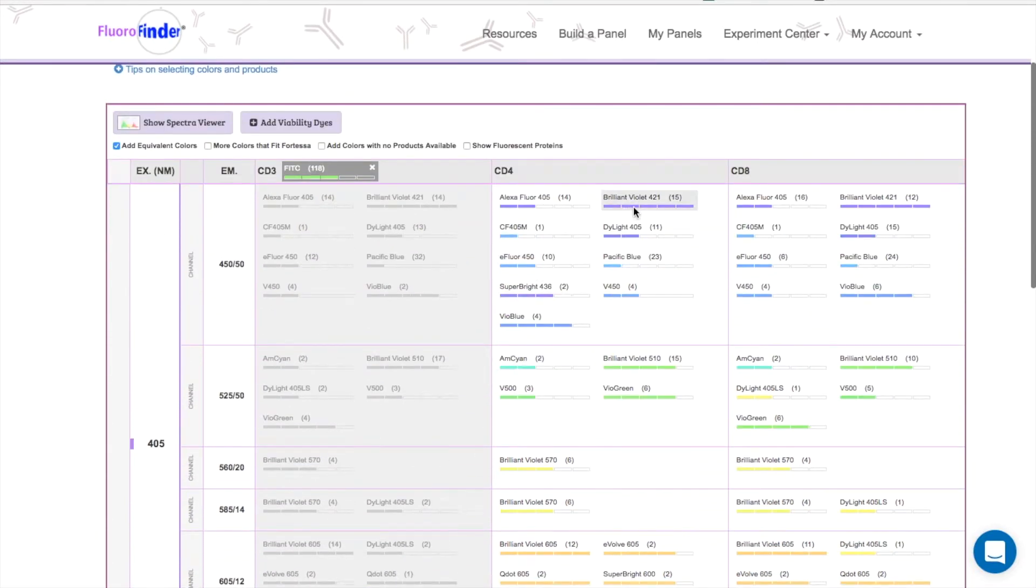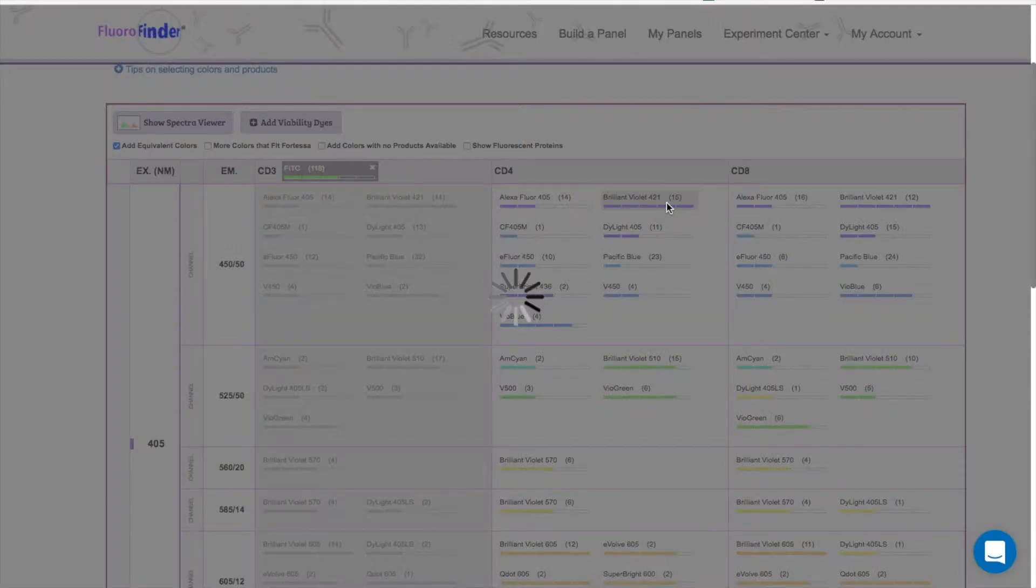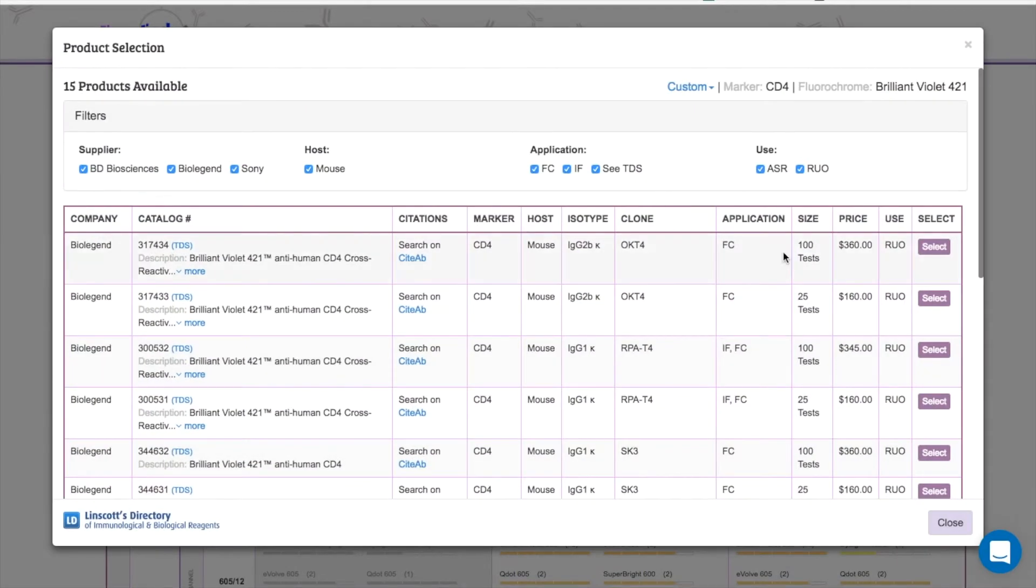It also blocks out all the other products for CD3, preventing me from accidentally choosing two products for one marker.